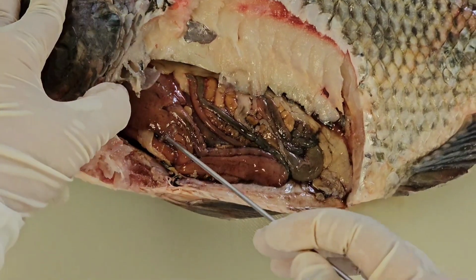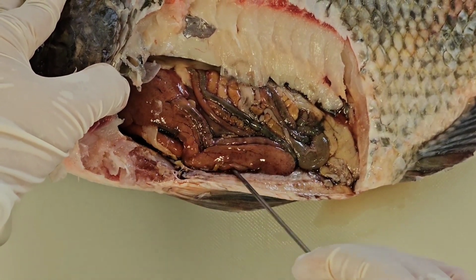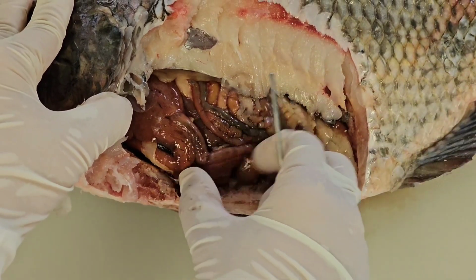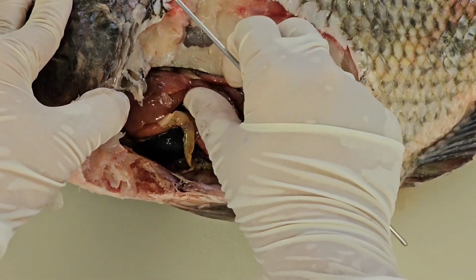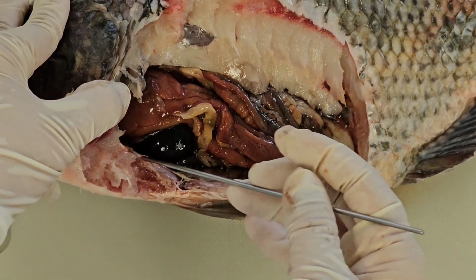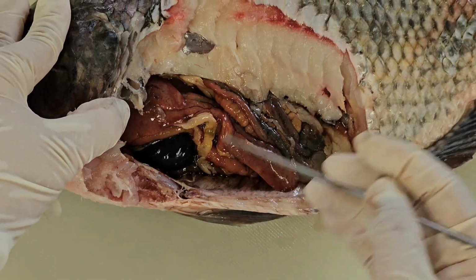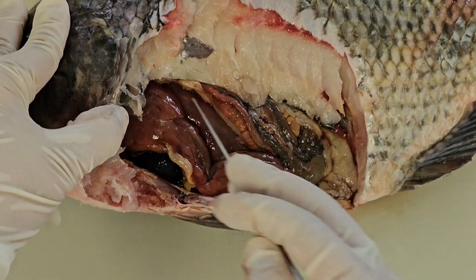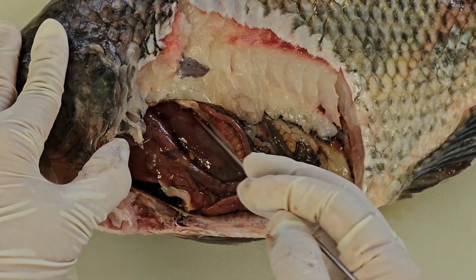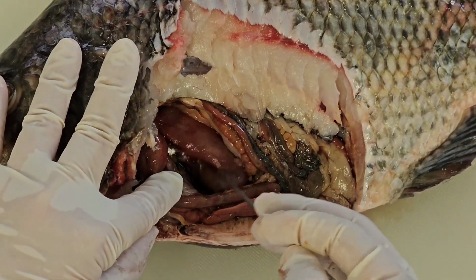If you look inside the abdominal cavity, you can see part of the liver. So you can see the structure of the liver here. Underneath the liver, you can see a big sac. This one is the gallbladder. In front of the liver, you can see the structure of another sac. So this one is the stomach.